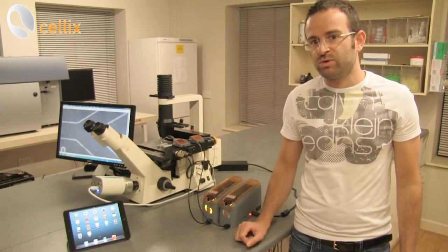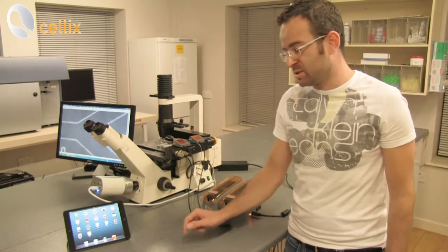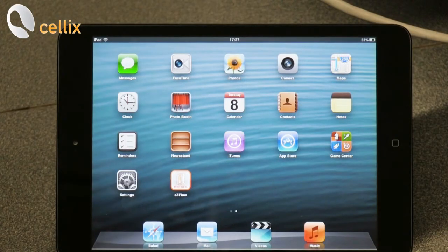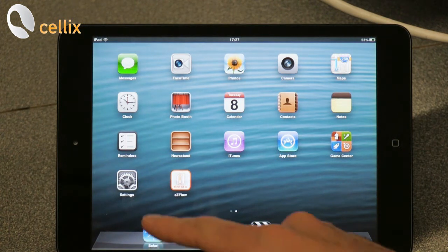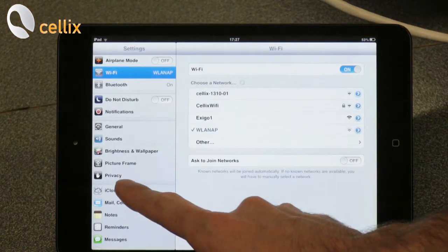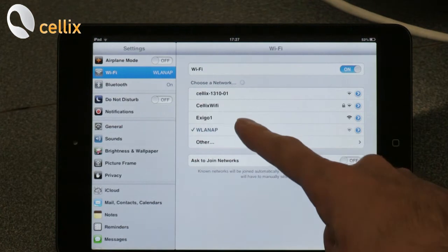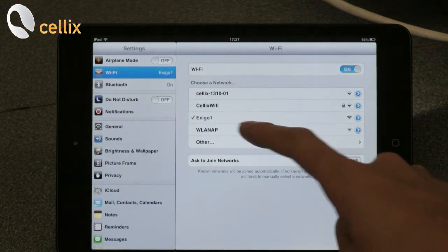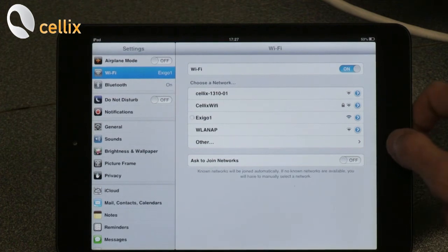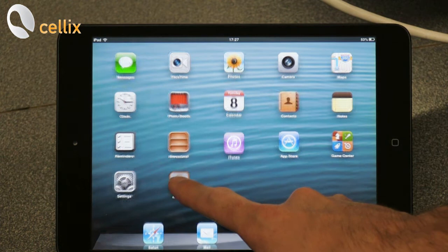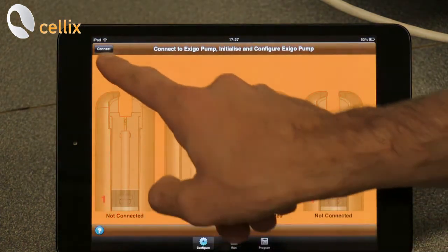Now I will show you how to control the two pumps using the iPad mini. First I want to show you how to connect to a Wi-Fi network established by the Exigo pump. So we click on the settings icon and then we can see the networks available. We select Exigo, close the settings and then we start the Exigo app and we click connect.